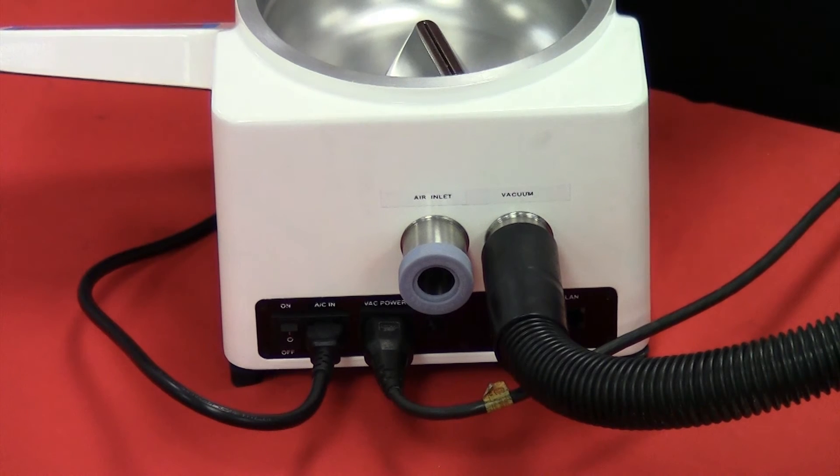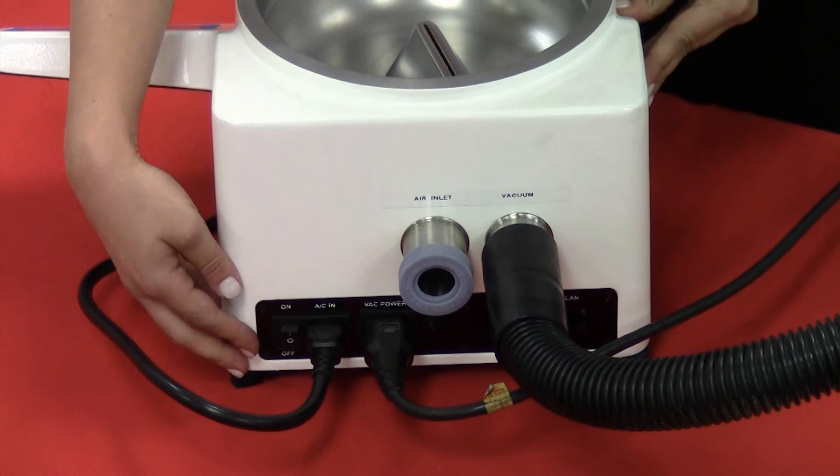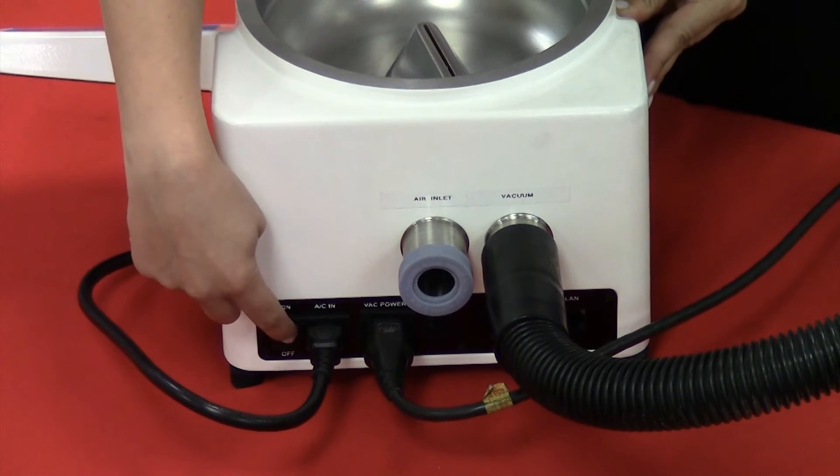Now that the initial setup is complete, we're going to power on the unit by using this power switch in the back of the unit. We're going to switch it to the ON position.